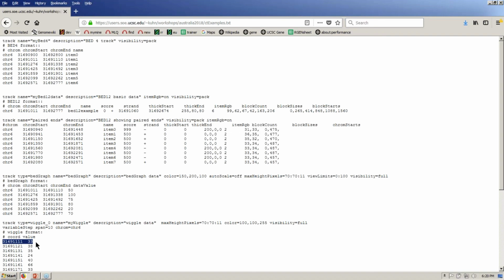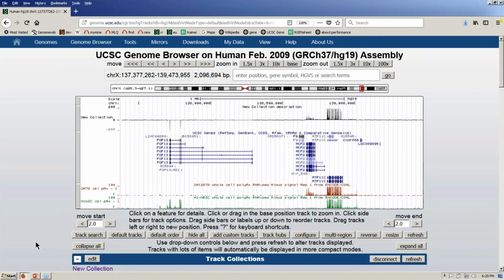If you use an antibody to pull some DNA out of the genome, then the coverage reflects that antibody. That's what leads to some of the data tracks we have in the ENCODE project, where we have transcription factor binding sites and so forth. These tracks right here are in bigwig format, which are simply a binary compressed version of the bed, I'm sorry, the wiggle format.